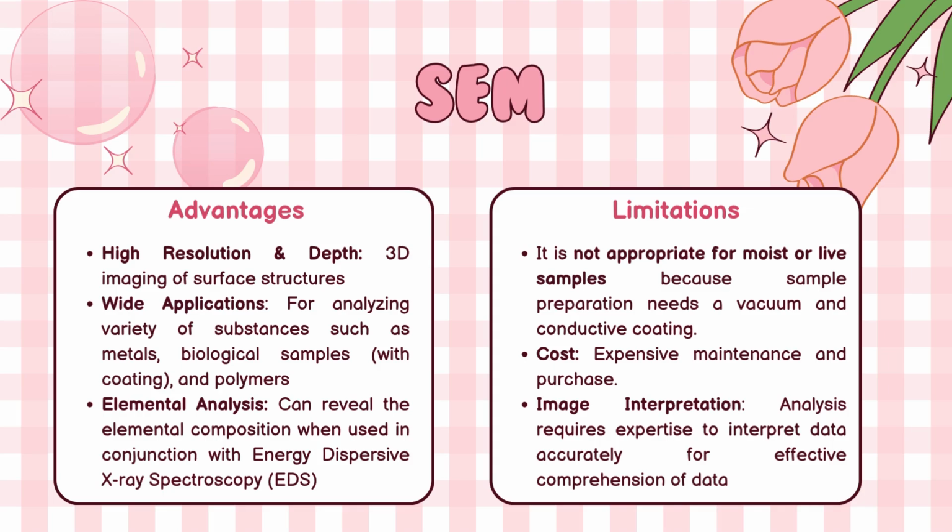Other than that, the limitation of scanning electron microscopy is that it is not appropriate for moist or live samples because sample preparation needs a vacuum and conductive coating, and it is very costly because of the expensive maintenance and purchase. Last one is image interpretation. Analysis requires expertise to interpret data accurately for effective comprehension of data.